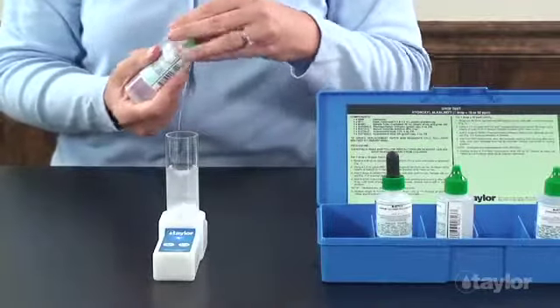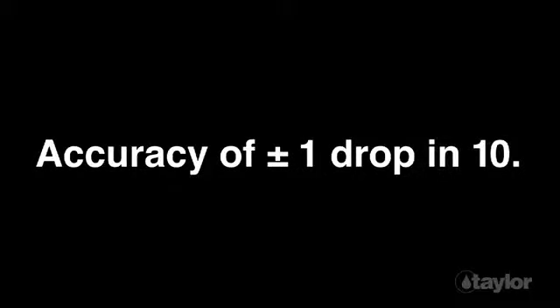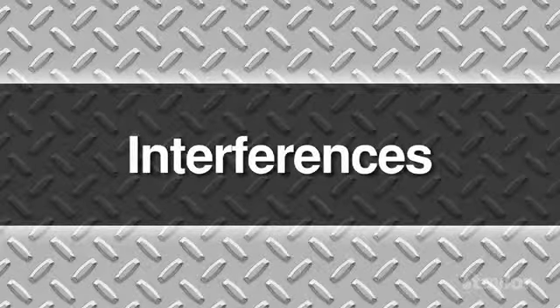easy to recognize. Drop tests are very economical and provide test results with an accuracy of plus or minus 1 drop in 10. There are no potential interferences for this test.